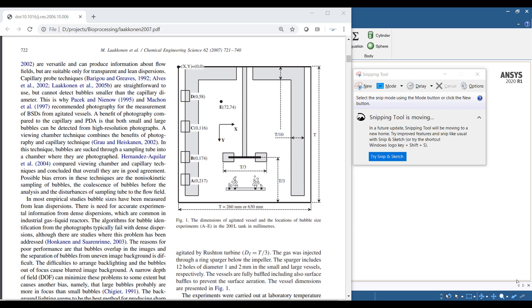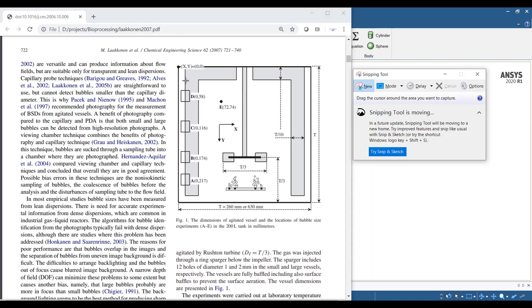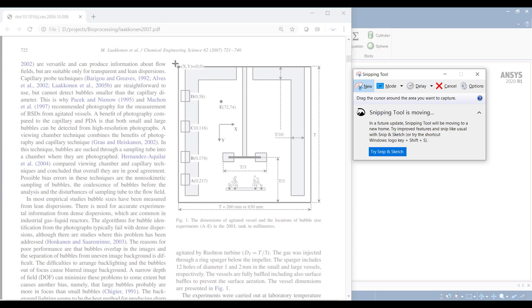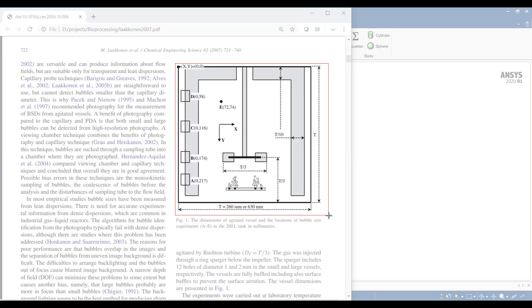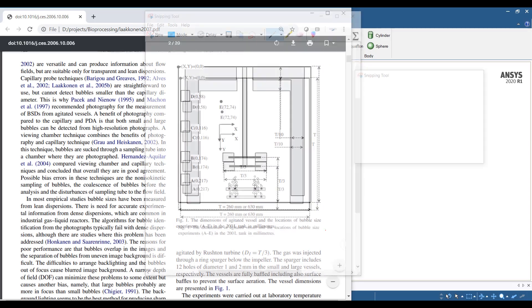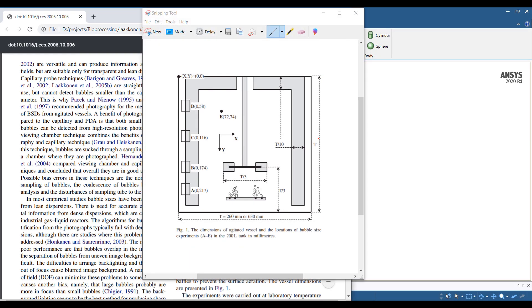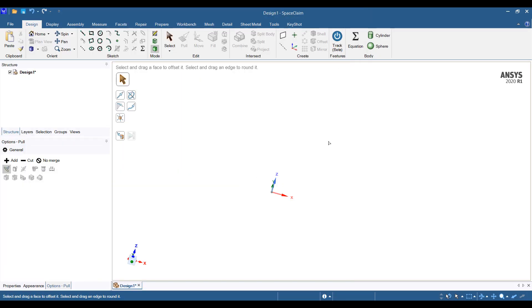Hi everyone, this is Ming Yao from Singularity Engineering, and this is the first in a series of presentations I'll be doing about bioreactors. In this first one, I'm going to create a bioreactor model from scratch just to show you how easy it is to do this type of stuff in SpaceClaim. I'm going to start by taking a quick screenshot of a bioreactor, this can be a blueprint schematic or anything, and then I'm going to go into SpaceClaim and start drawing this.